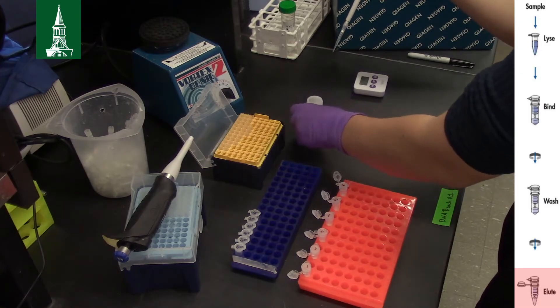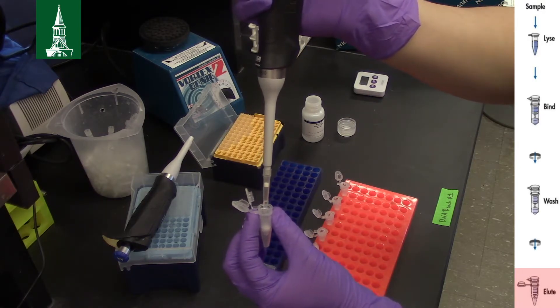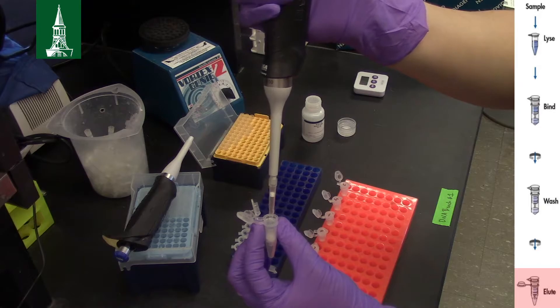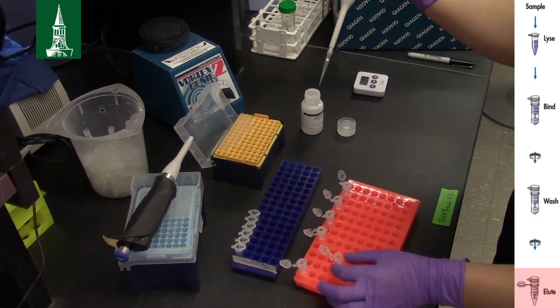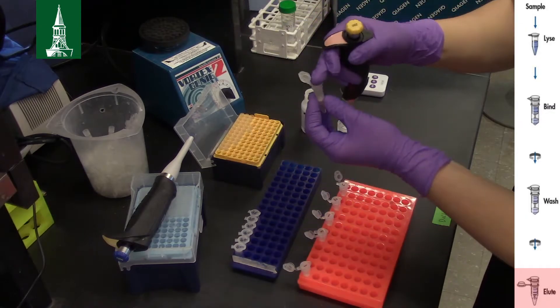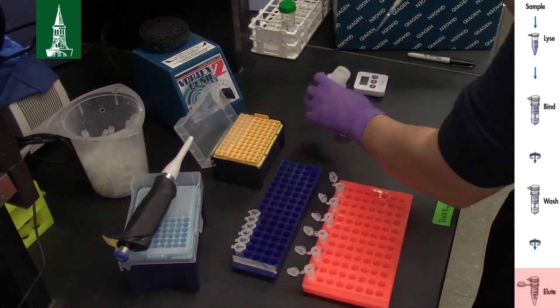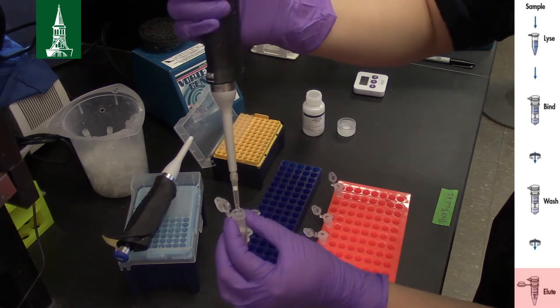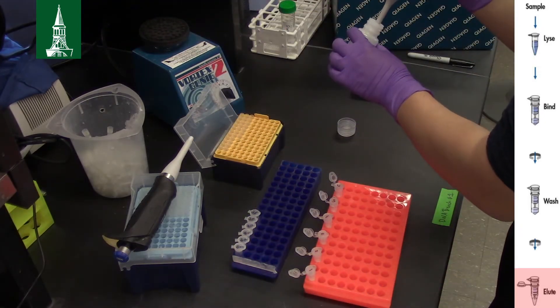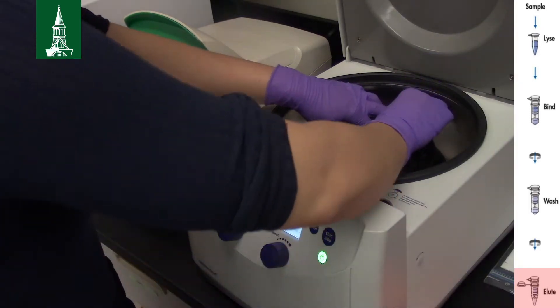Pipette 80 µl of buffer AE directly onto the membrane in the spin column. This volume should be chosen depending on the desired final DNA concentration. Use more buffer AE for lower final DNA concentrations and an increased overall DNA yield. Incubate at room temperature for 1 minute. Centrifuge for 1 minute at 8000 rpm.